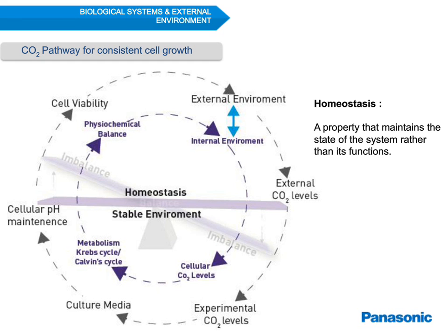That is why it is important to know the carbon dioxide recovery and carbon dioxide maintenance levels of your incubator at all times. My colleague Carl has more insight on these topics that I just spoke about, and therefore I would like to pass over the rest of the presentation to him. Carl, over to you. Thank you.